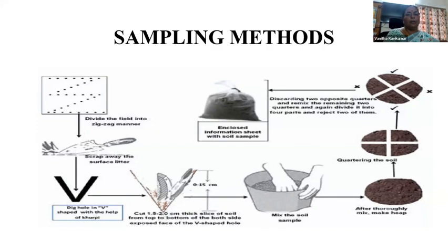This is for both shallow rooted and deep rooted crops. Whether the depth is 15 centimeter or 30 centimeter, the procedure is the same.